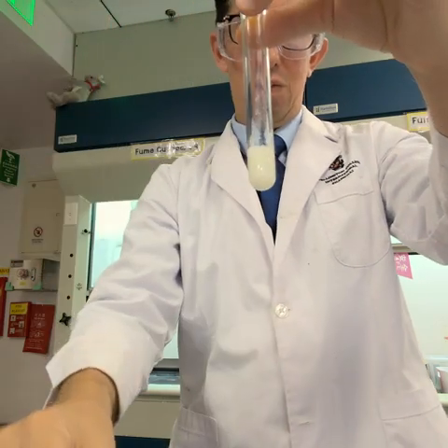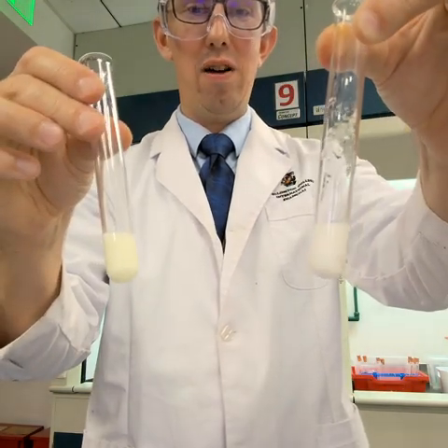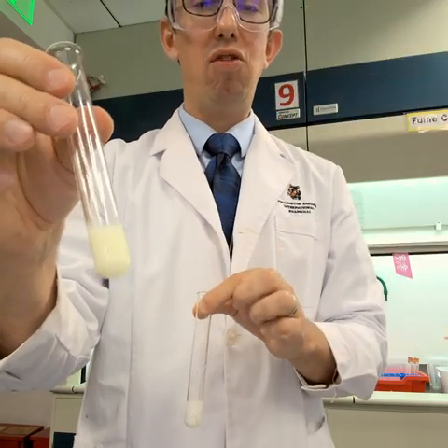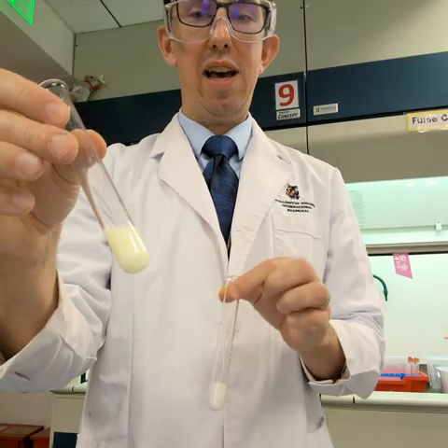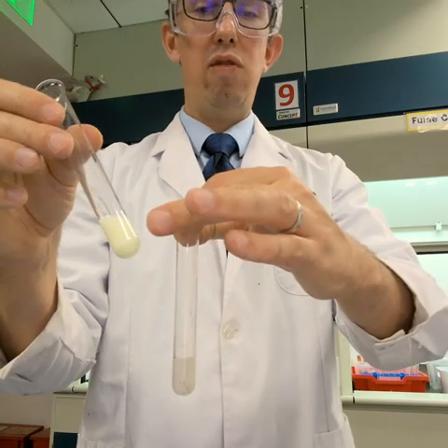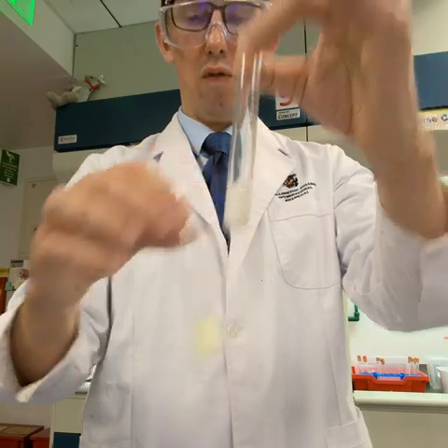And you can see that this one also looks white, but it's slightly less white. You can see this is the chloride one, very white. This one's more of an off-white or a cream color. So in the exam, please say cream. And if it's cream, it is bromide. And I should have said what's forming the precipitate is the silver from the silver nitrate getting with the halide. So this cream solid is silver bromide, and this white solid is silver chloride.